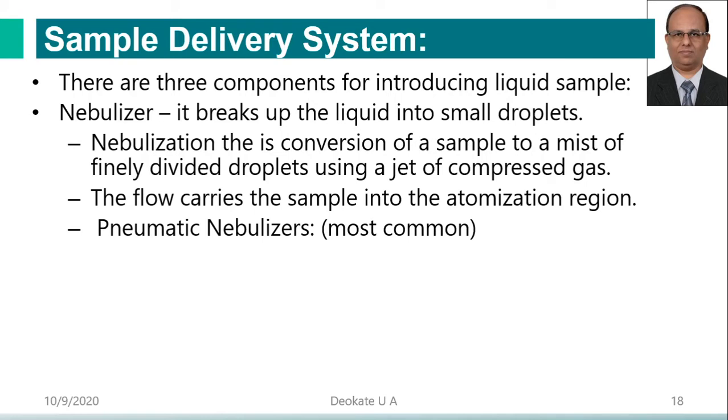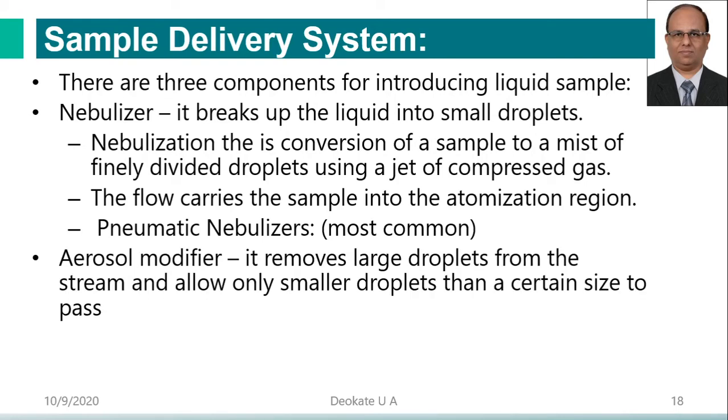Okay, so there is a creation of a small vacuum, and that will result in the sucking of your liquid through this capillary. Okay, so there is a formation of a negative pressure due to the flow of your carrier gas and the fuel gas. That will result in the small vacuum creation, and that will suck the liquid from the beaker. Then there are pneumatic nebulizers. Okay, so that is the most commonly used, pneumatic, by using the pressure of your fuel gas.